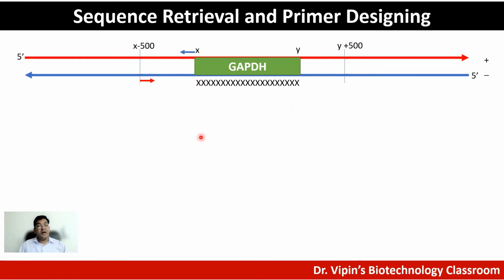And how do you do that? Your gene size is 3855 bases. If both primers were to be designed in the left flank or in the right flank, the maximum product size would be 500 bases, because the flank size is 500 bases. So if we define our minimum product size as 3855, then you're automatically instructing the software to design one primer in the left flank and the other primer in the right flank. So let's do that now.